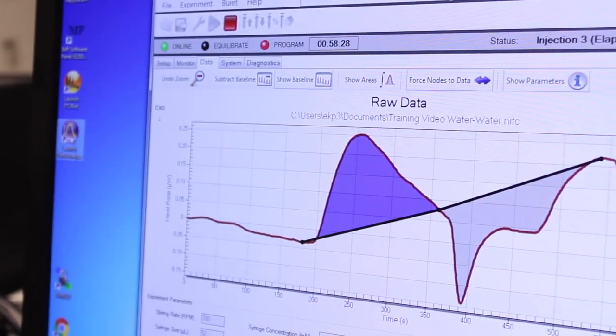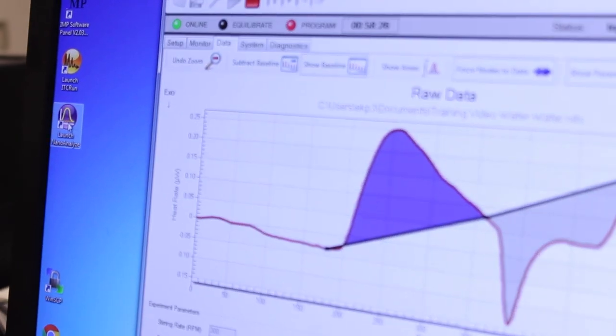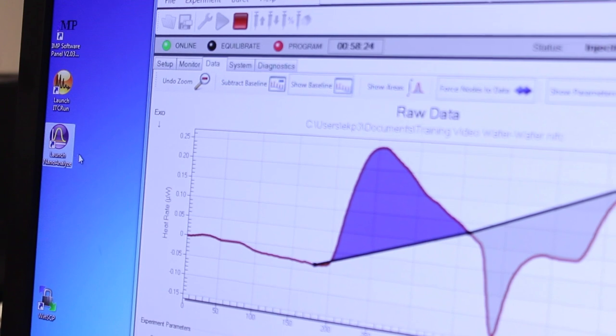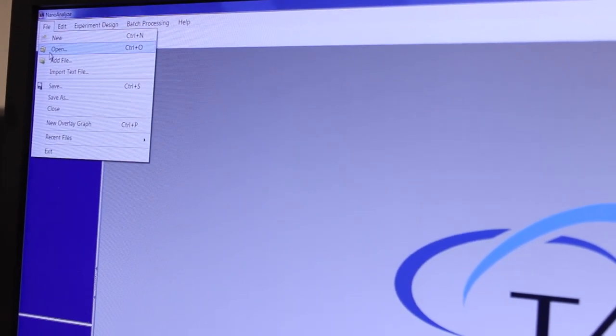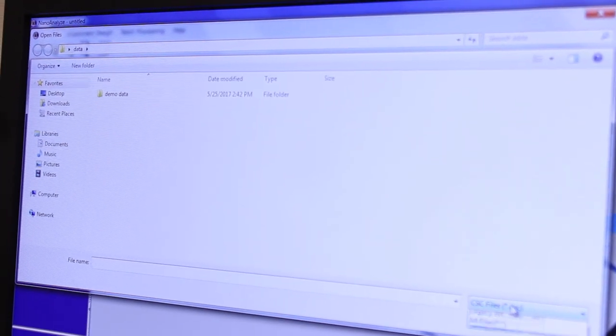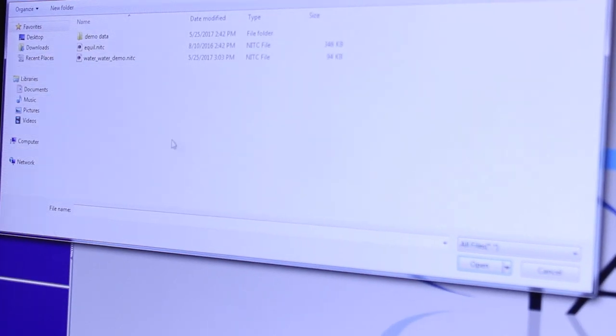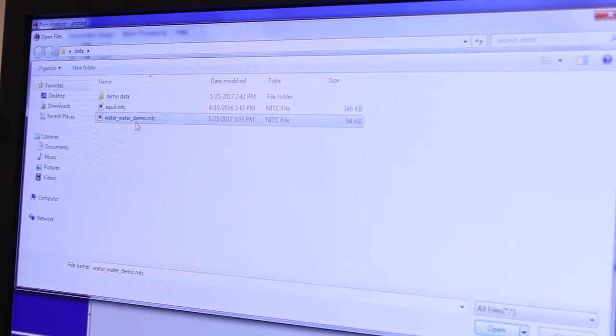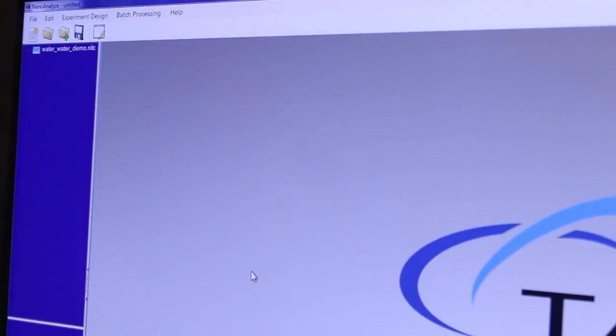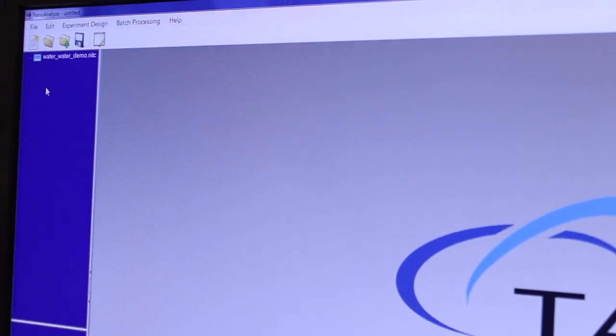But anyway the data is starting to collect and I'm going to pull up an older data set that was run previously to do that we're going to start the program nano analyze and we're going to open a data set.